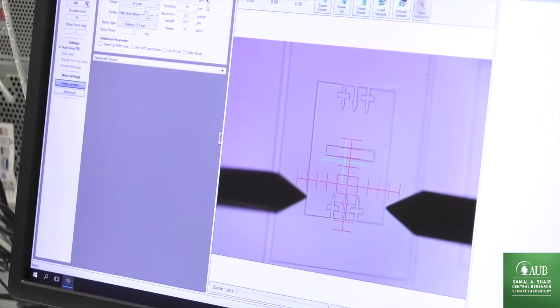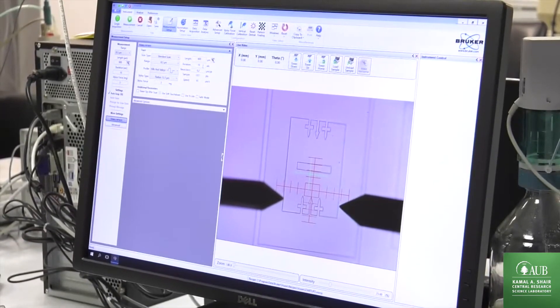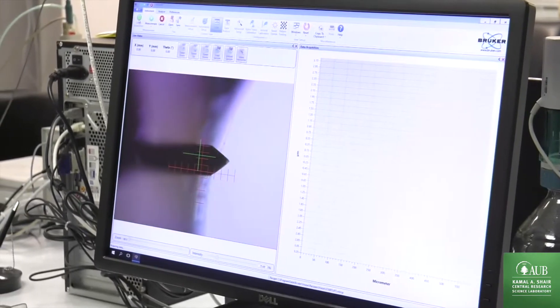We select the measuring parameters which are good and we try to make a preliminary scan to level the sample.